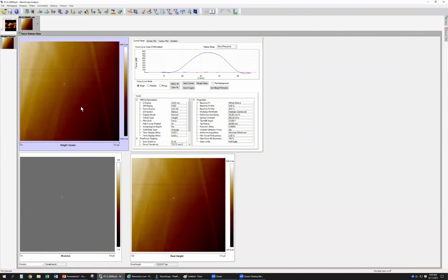So maybe later we extend the sample, then you can see this one. Here are all the parameters you should calibrate. The parameter to calibrate is this one, right?